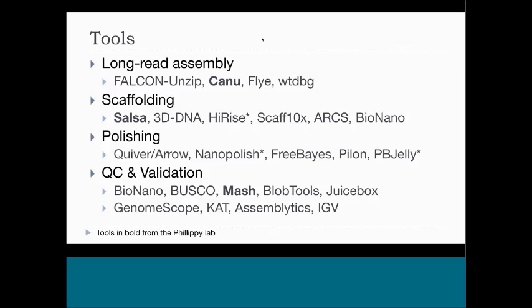Yeah, and there is an example in the Aedes preprint that shows a particular gene family expansion, which Falcon Unzip essentially correctly recovered the structure of, as validated by BioNano. But it was very hard to polish that region because of its repetitive nature. Even with the long reads in this case, it was such a large tandem duplication that it was difficult to align and polish. And so you end up with two of those genes that are very high quality, but then some of the paralogs at lower quality because of difficulty in mapping the PacBio reads for polishing. And so in these highly repetitive gene families, like those receptor families, that can still be difficult.